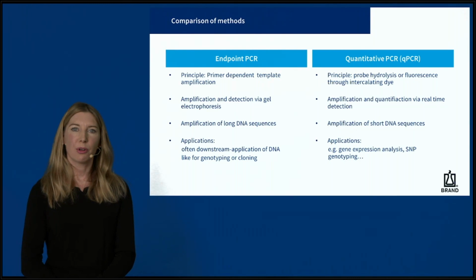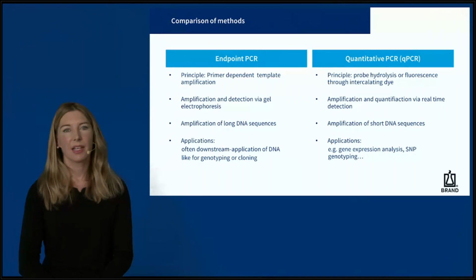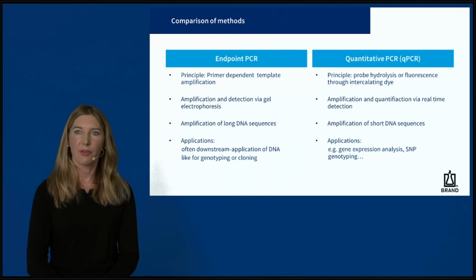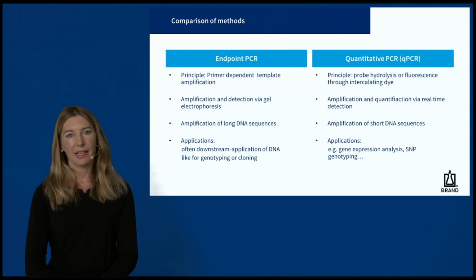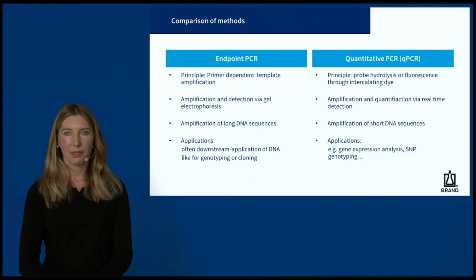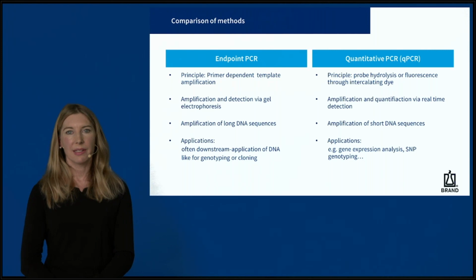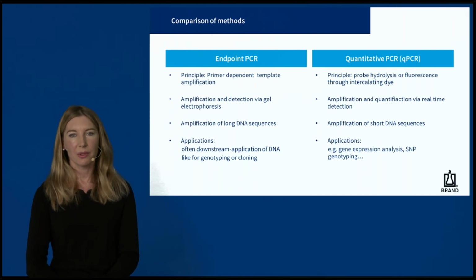With help of certain polymerase mixtures, further additives in the PCR reaction, and optimal conditions, even fragments longer than 20 to 40 kilobase pairs can be amplified. However, the efficiency of amplification decreases as the target DNA gets longer. To amplify RNA, a so-called reverse transcription PCR can be performed. In the first step, the reverse transcriptase converts the RNA into a complementary DNA. This so-called cDNA is then used as a template for exponential amplification using PCR.